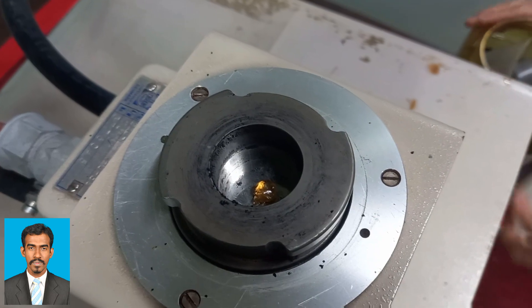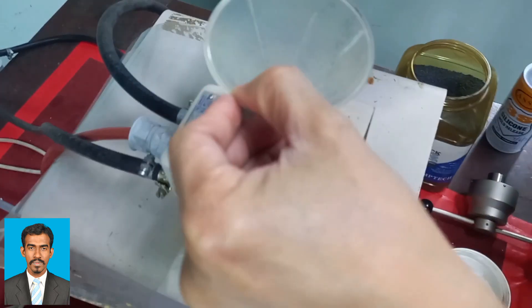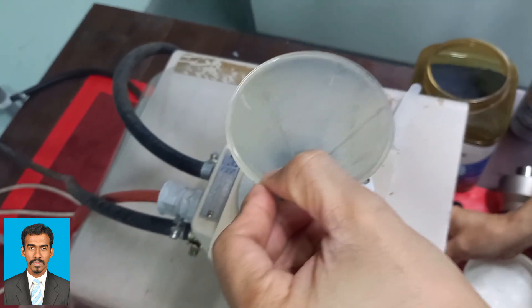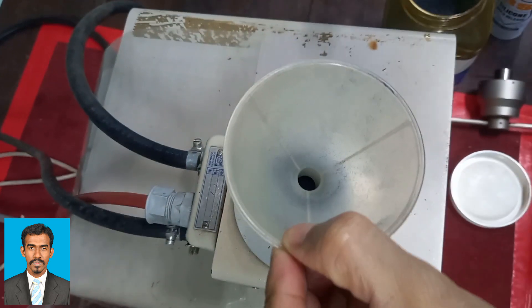Then put mounting compound or resin using a funnel. The compression mounting resins are typically in powdered or granular forms of thermoset resins such as phenolics, melamines, and epoxies. In this experiment, Bakelite Black is used as the mounting compound, which is in the granular form.